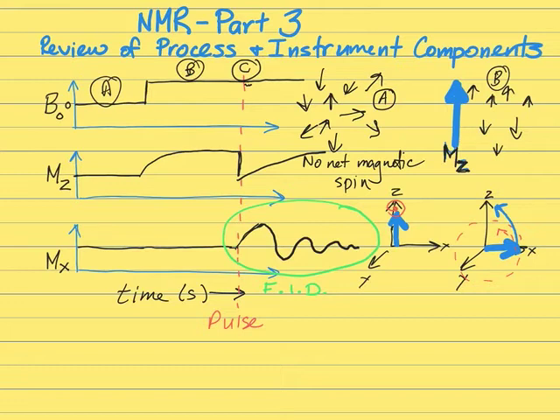Okay, so now that we've reviewed the process that occurs in the NMR experiment, or the duration of collecting an NMR spectrum, let's take a look at what kind of instrument components we need.